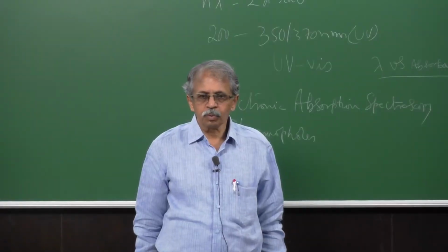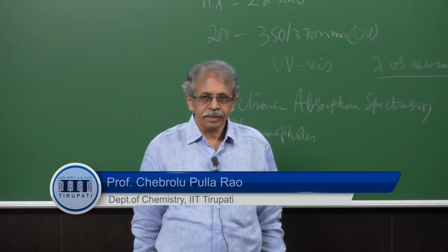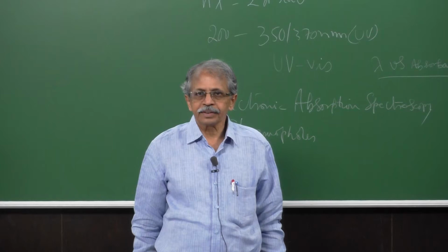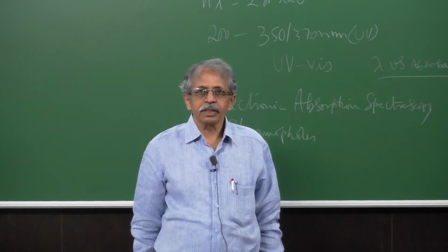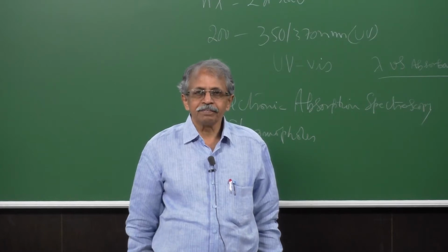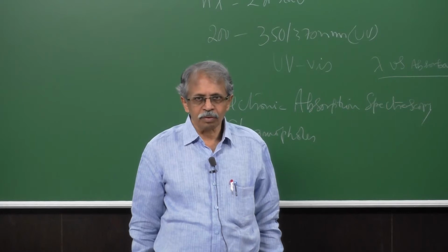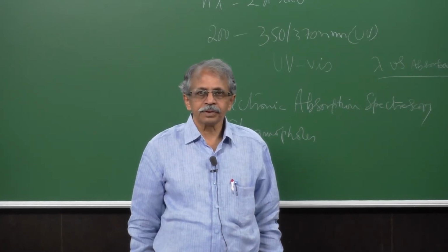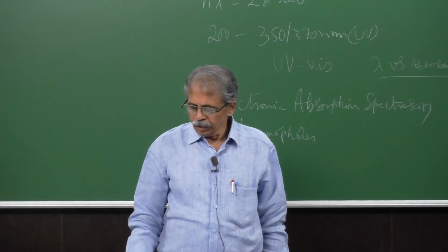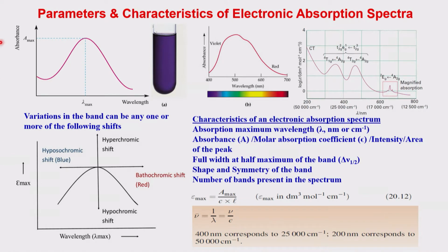Good morning, welcome you all. This topic on absorption spectroscopy, which I began in the previous class, let us continue with it. In the previous class, I have already given you the very basic principle of it. I also mentioned that the instrumentation part is not important for the chemist. The chemist is more concerned with the spectrum and its interpretation. So let us look at this particular slide.